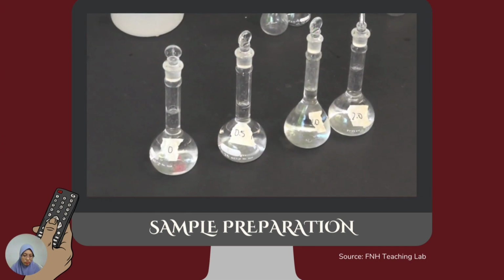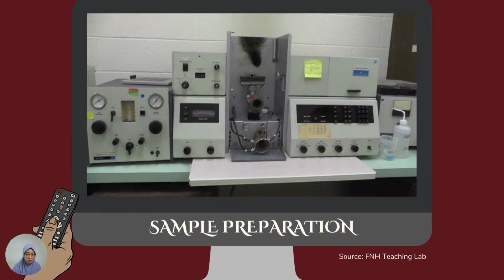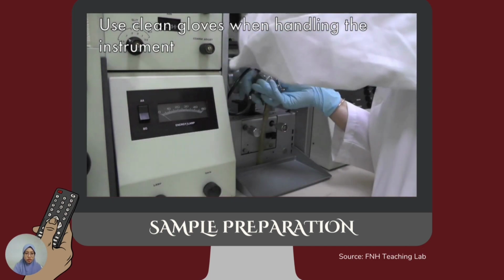All samples and standards will be measured using the atomic absorption spectrophotometer. Bring your samples and standards together with DD water to the instrument. Your TA will briefly show you how to ignite the flame. You must assemble the sample slot, ensuring that it is screwed on tightly. Otherwise, you will observe leaks when DD water is being fed into the instrument.